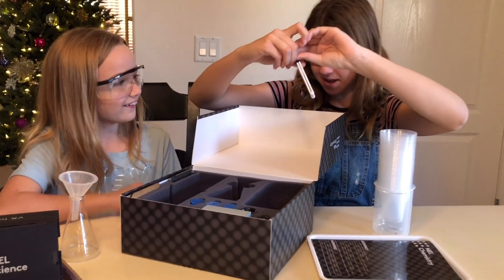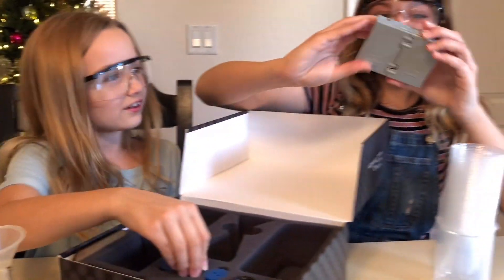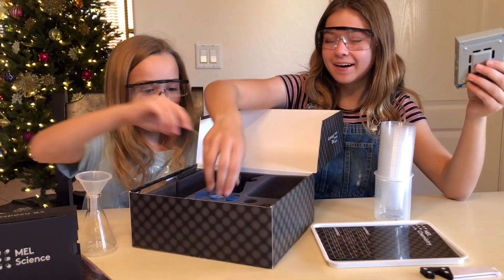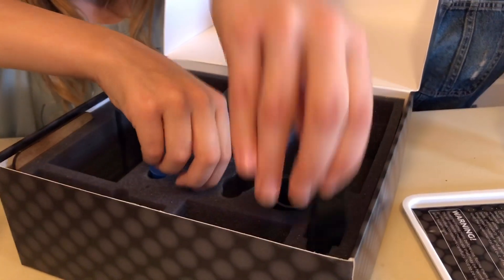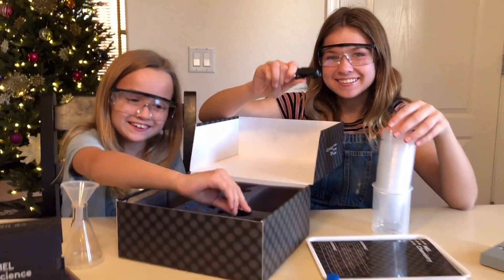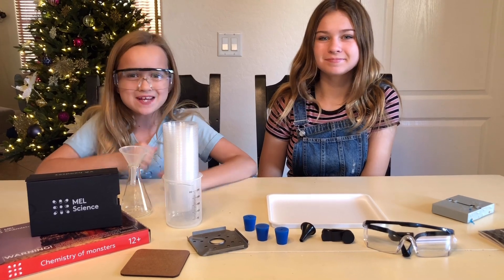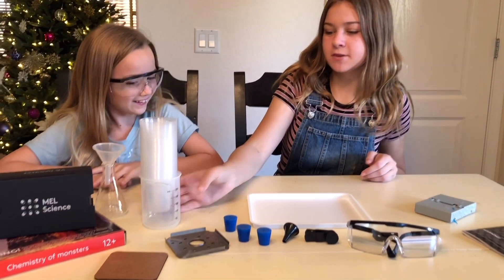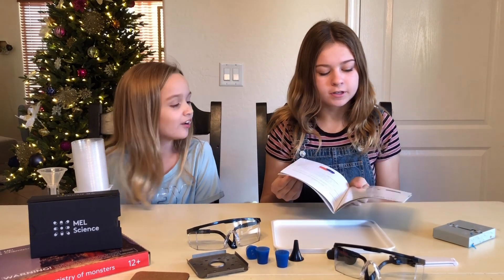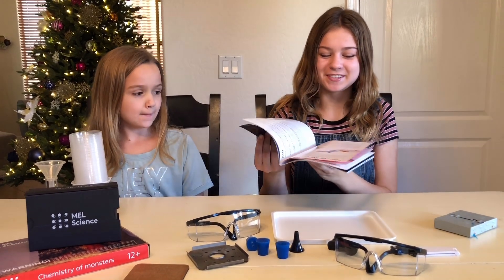There's a clamber box and these things that lock up something. We don't know what any of this stuff is, but that's the fun part because we get the instructions and then we get to see what these things are. There are so many experiments you can do with all this stuff. This is the instruction manual - it has all the guidelines and safety and teaches you how to do all these experiments. There's a lot of pictures too, because pictures are cool.